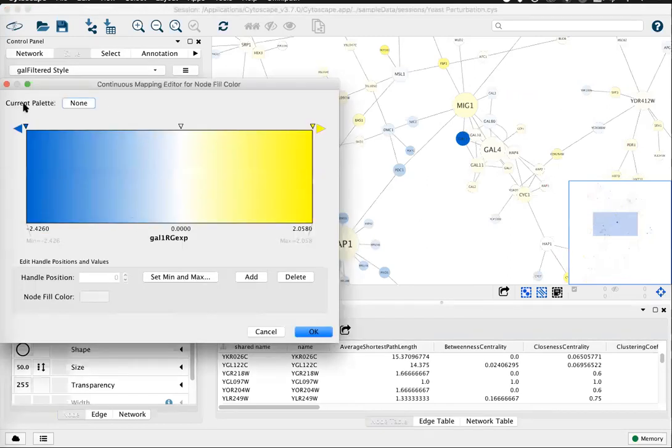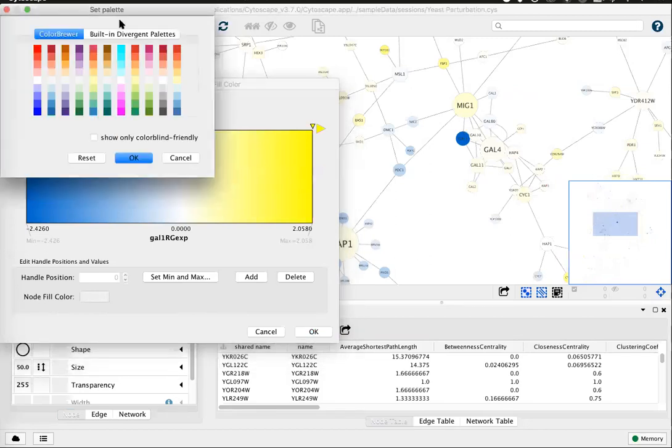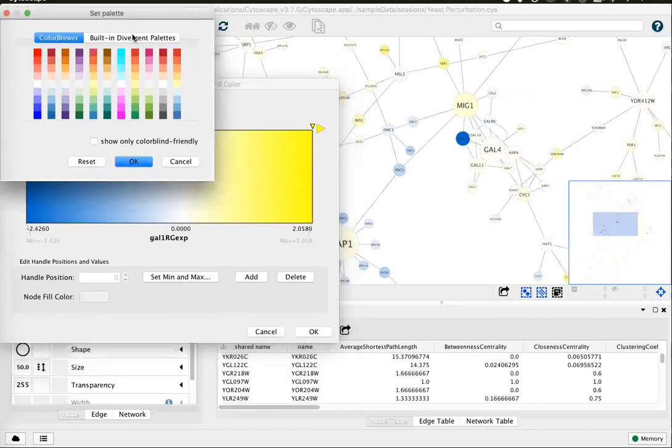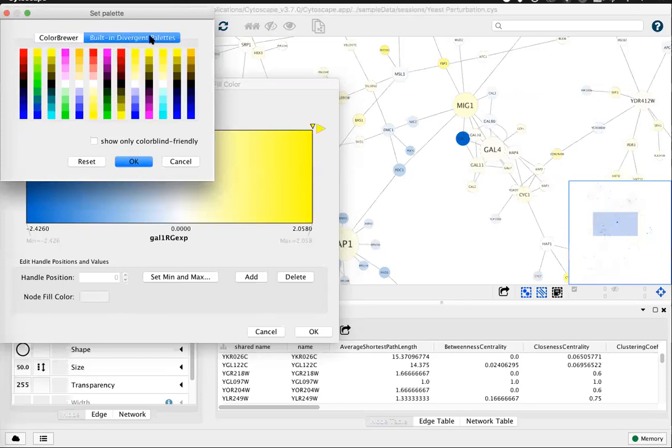This new option is here under current palette, currently none. Click on that and open up choice of Brewer palettes and other divergent palettes.